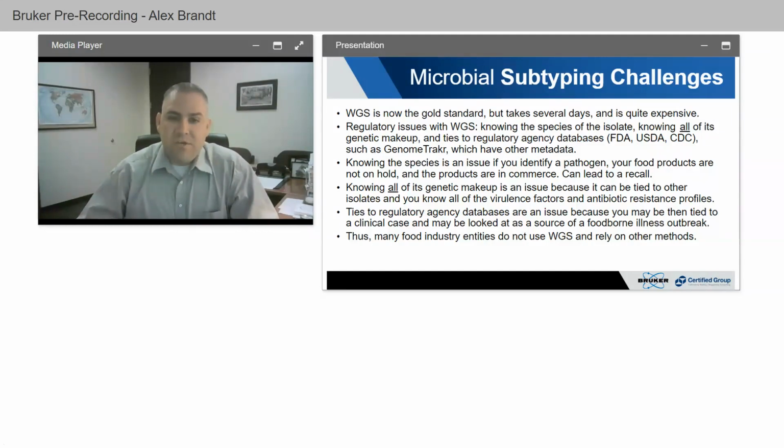So a lot of food industry entities really avoid using whole genome sequencing and rely on other methods to do their subtyping, even though it's the gold standard and even though it gives you the most information about linking isolates together.